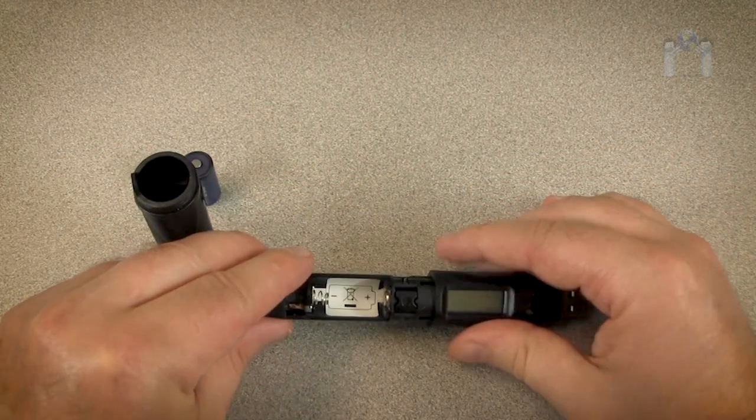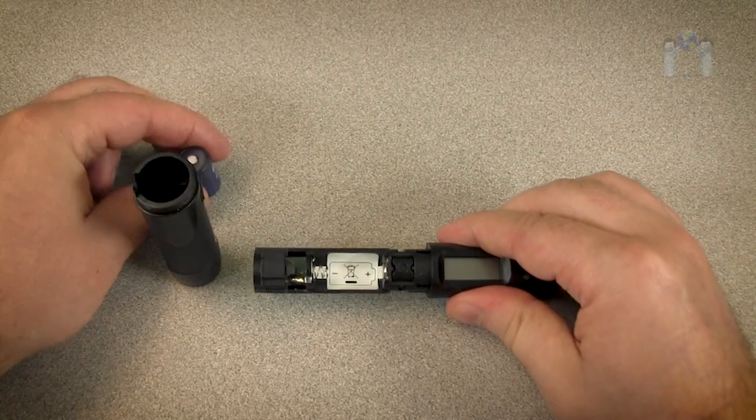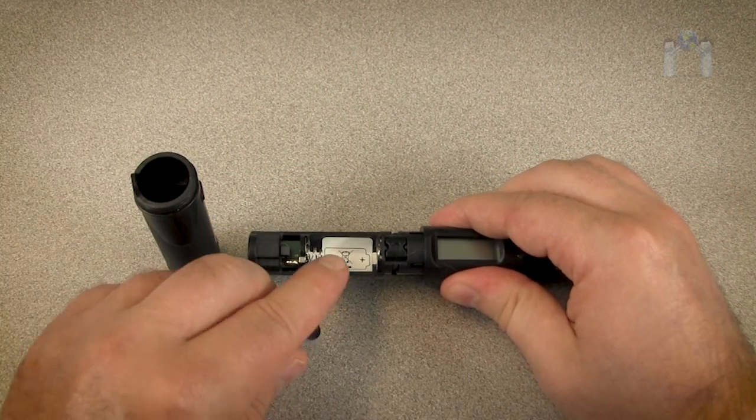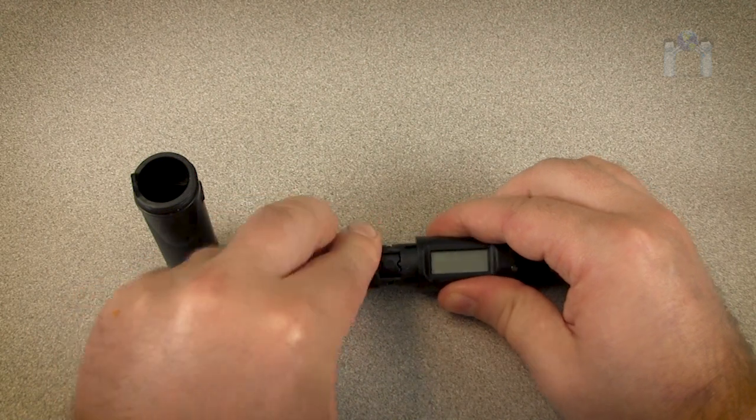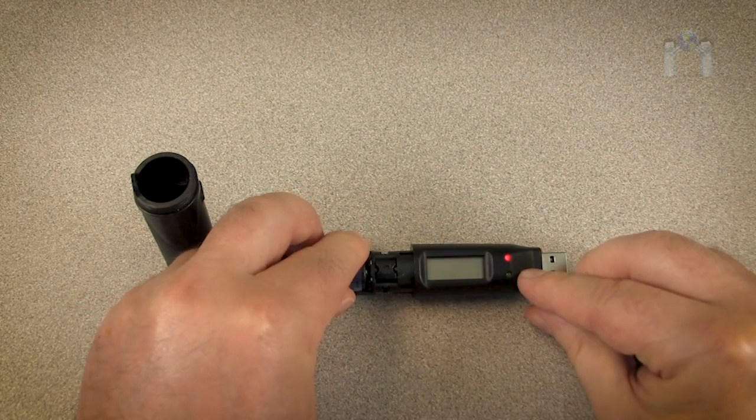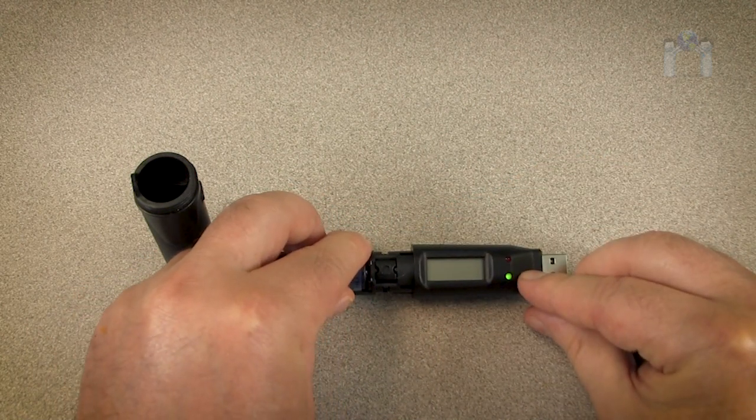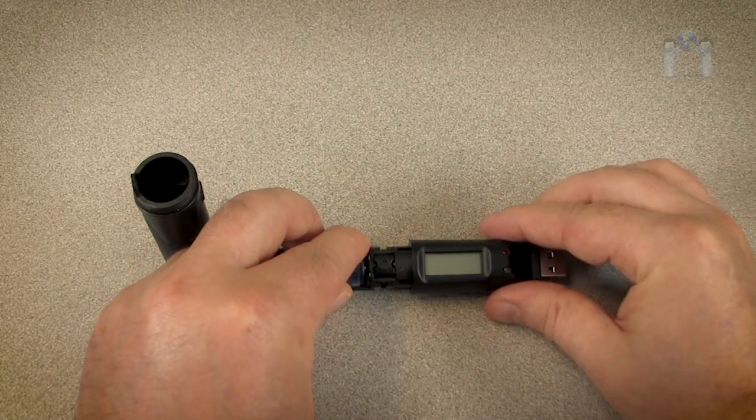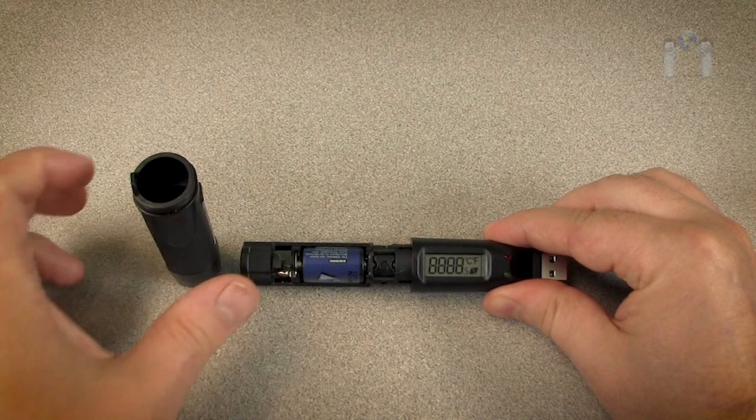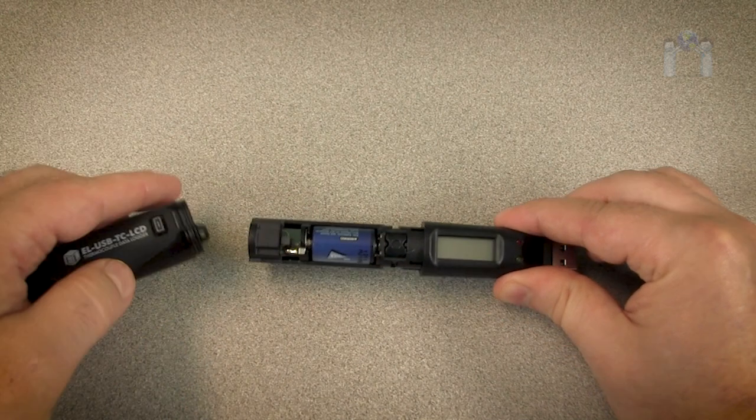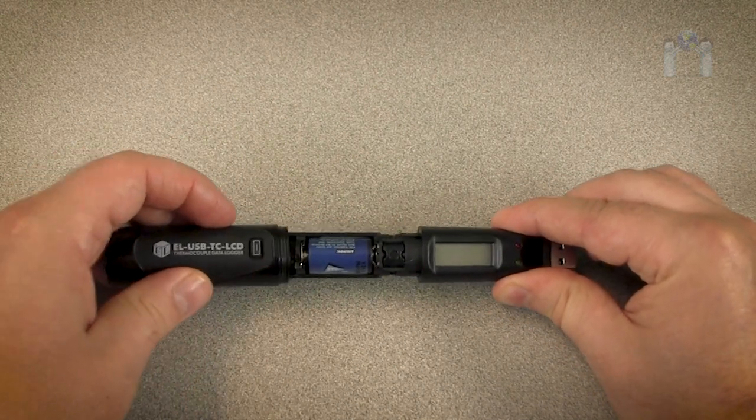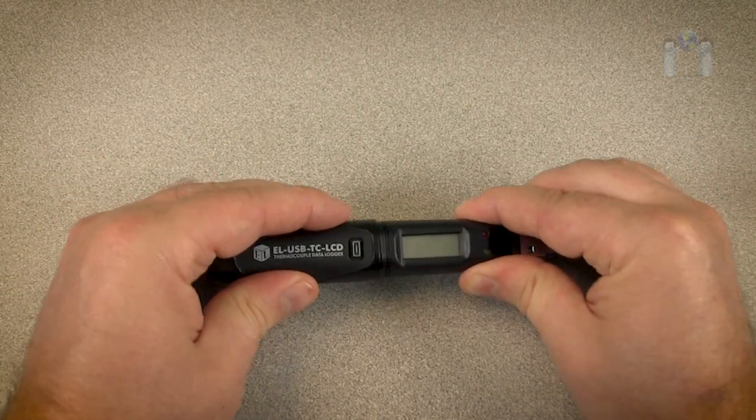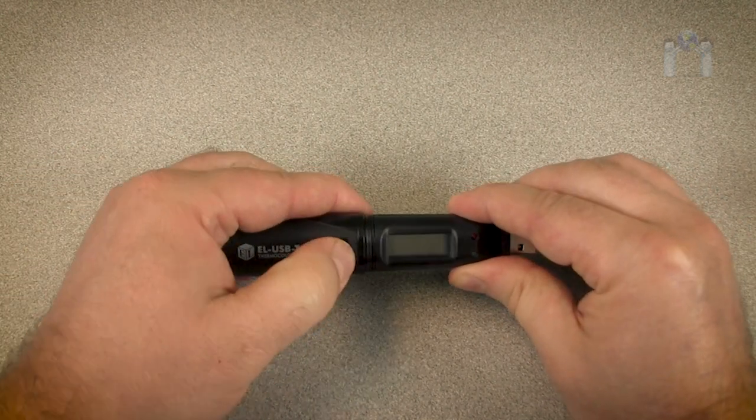Remove the cover and replace or insert the battery, paying attention to the polarity. You should notice the LED lights flash when the new battery is properly installed. Slide the cover back on and you are ready to set up the data logger.